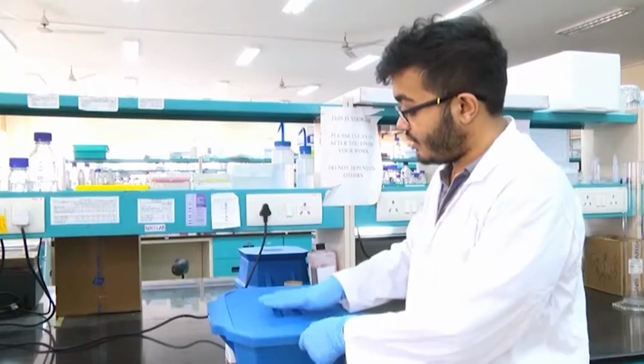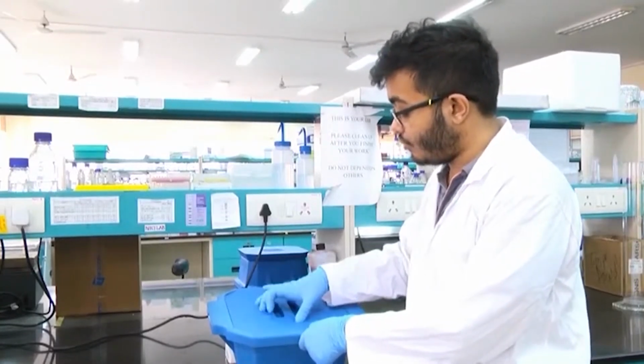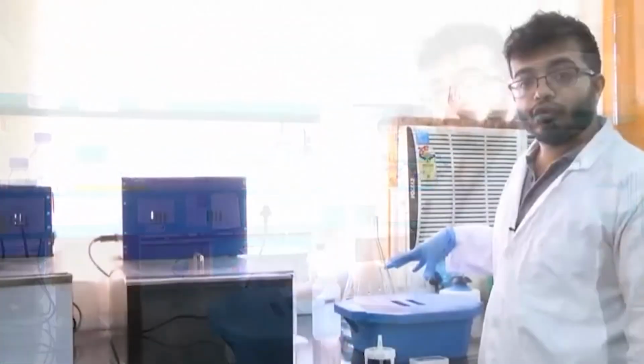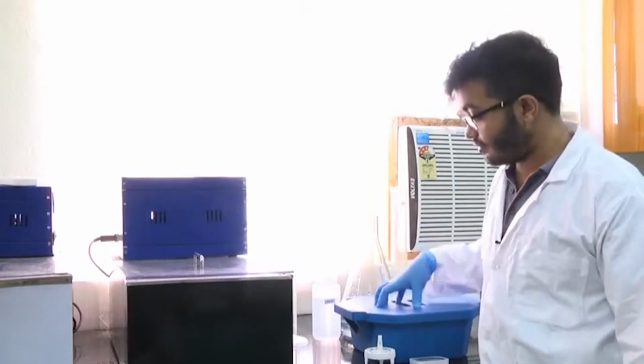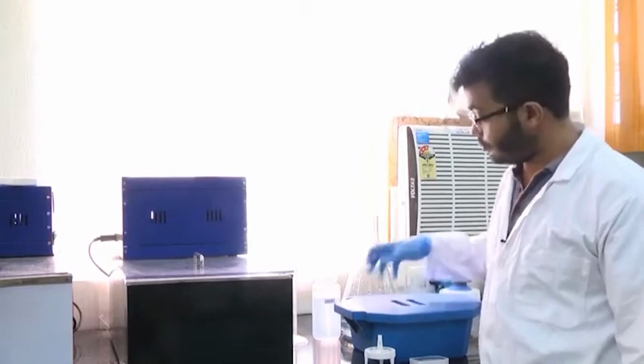What I am going to do is, I will just make sure that the DNA and bacterial cells are incubated for an hour, after which we are going to proceed to our next step. So, we have been incubating our ligation product with the chemically competent DH5 alpha cells for an hour now.